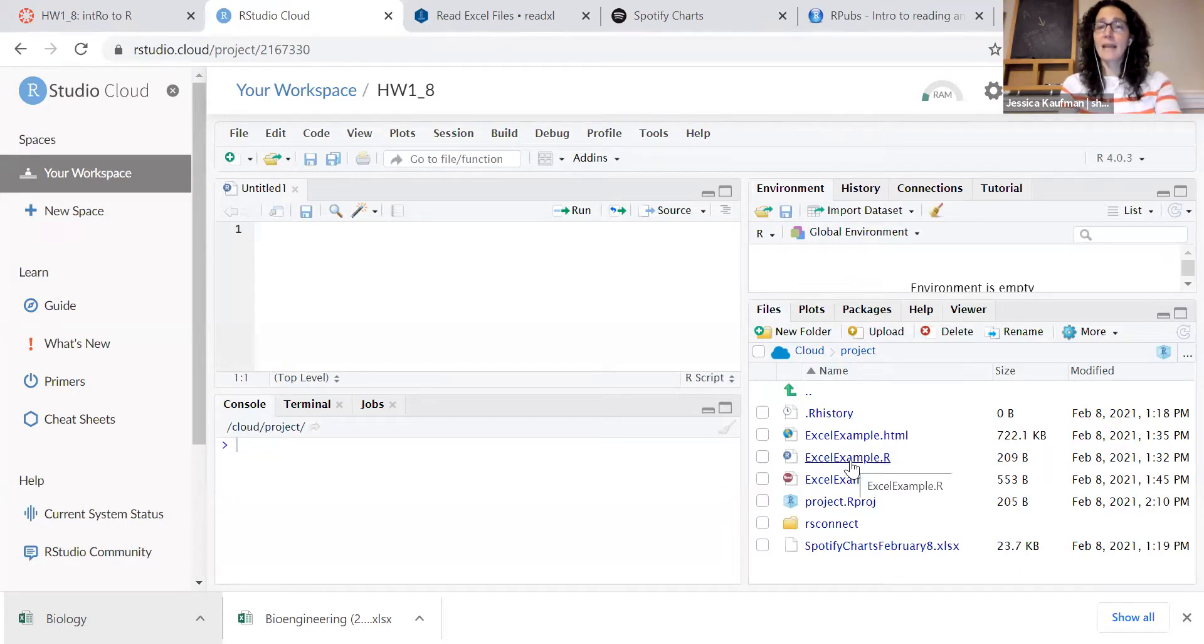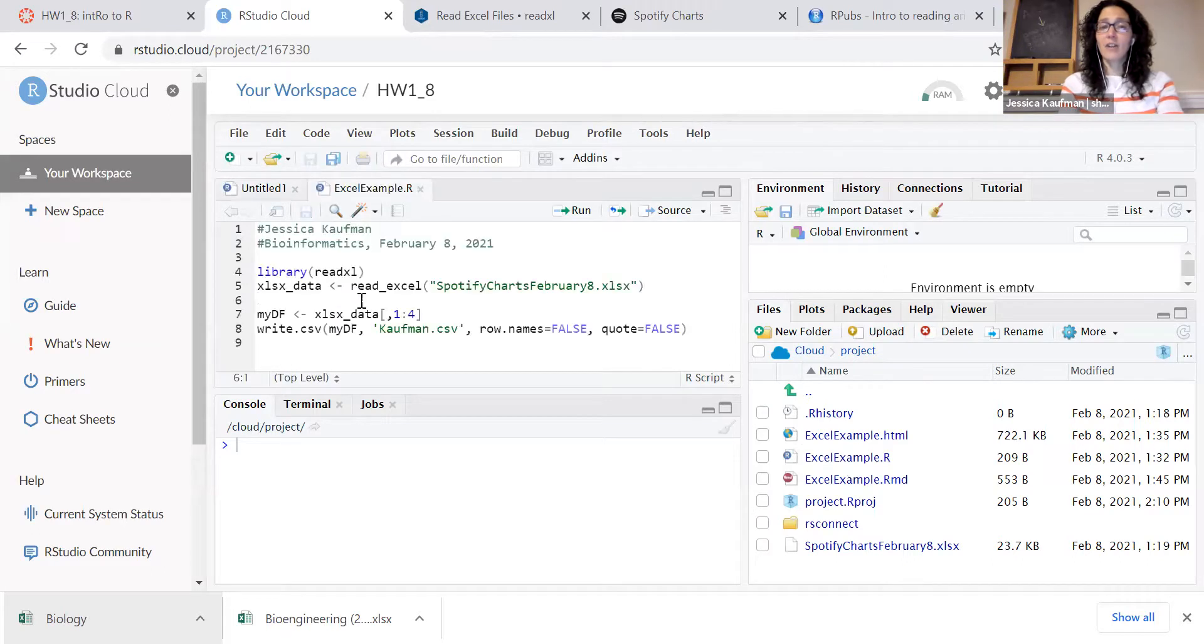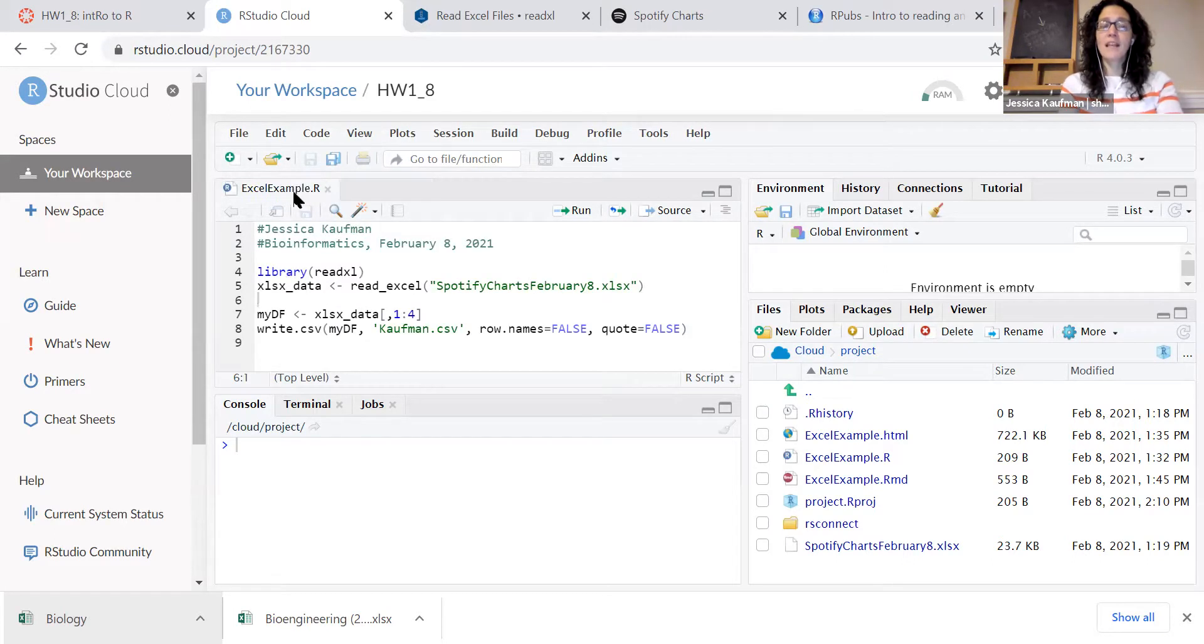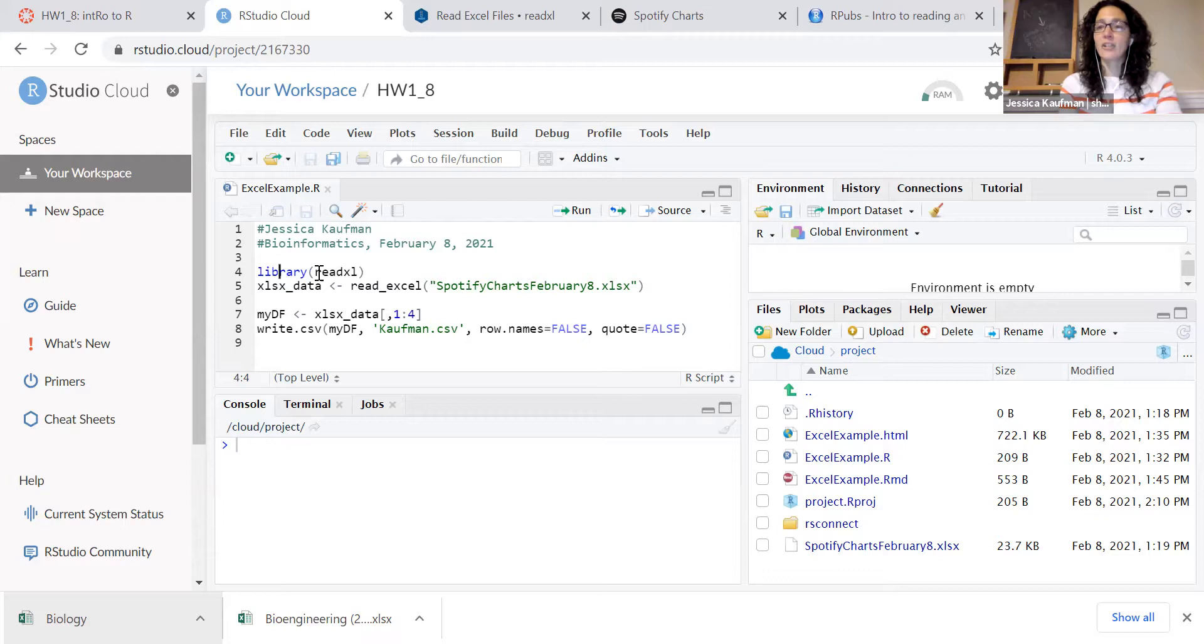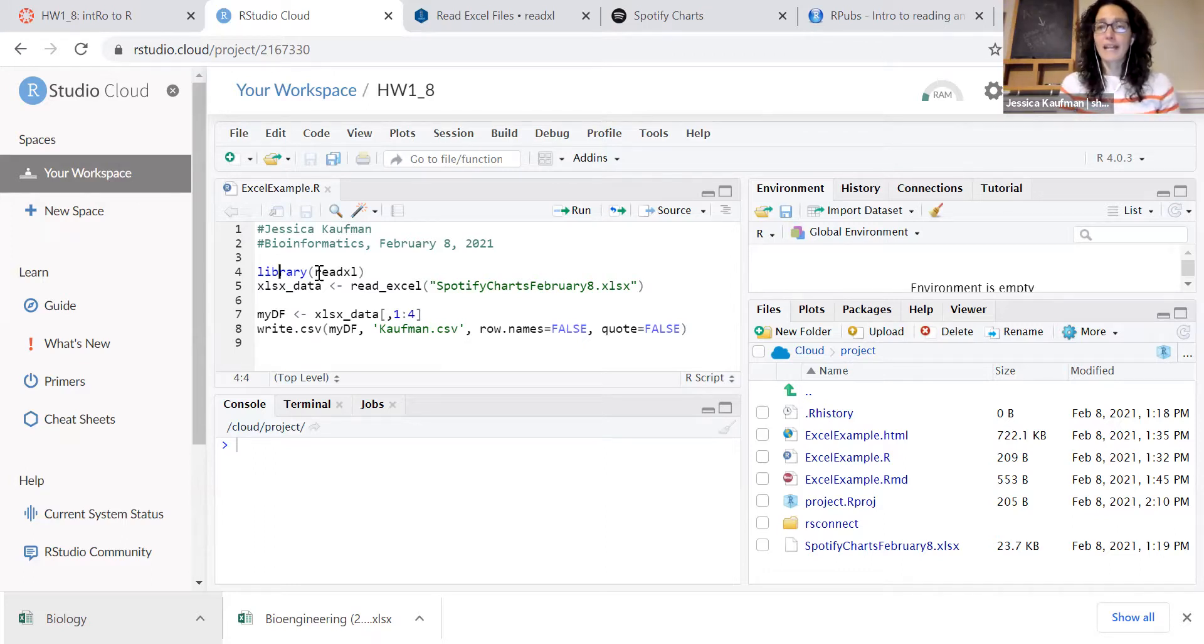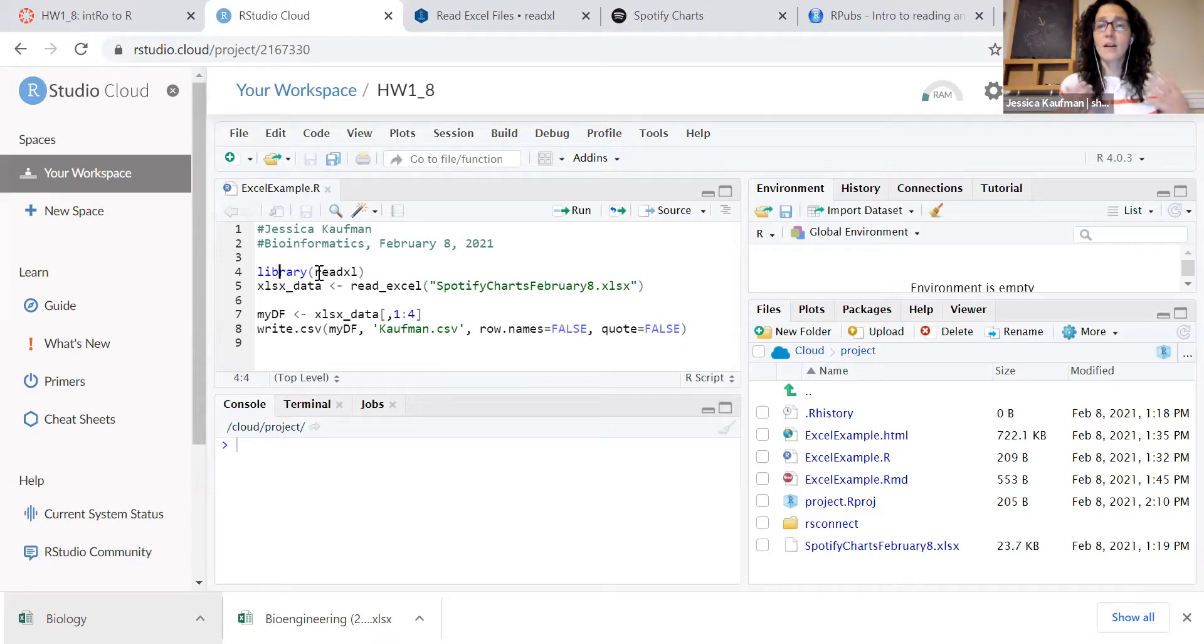I've already made an R script, so I'm going to just open it up. The first line of the R script is to run the library command on a package. A lot of the tools that we use in bioinformatics will not be commands that are part of base R.